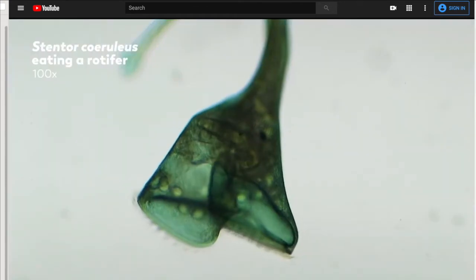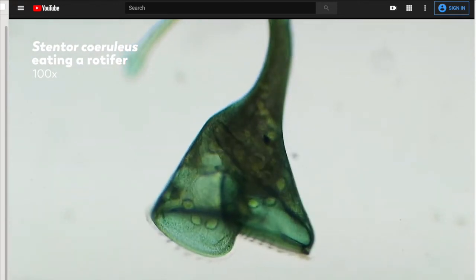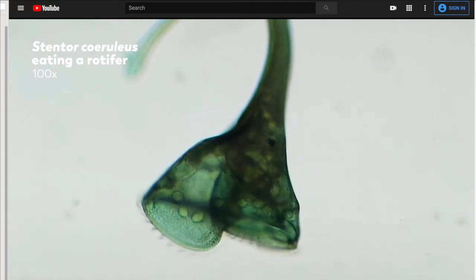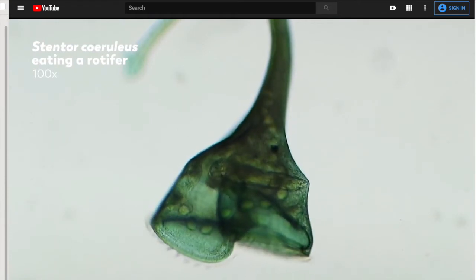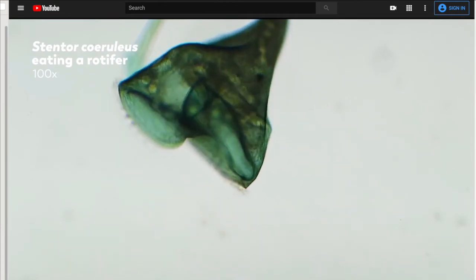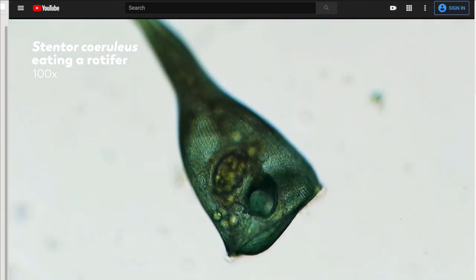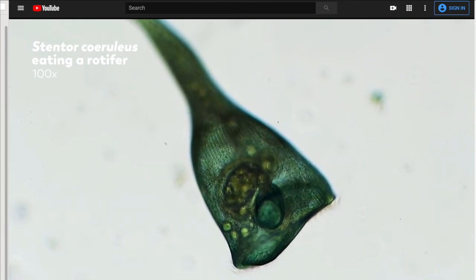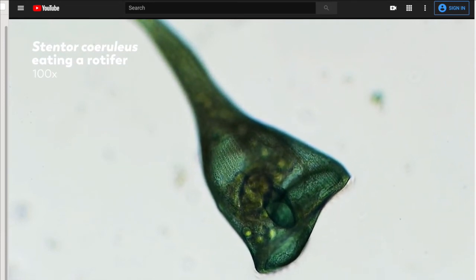digested. Just like this multicellular rotifer, which is swallowed by the giant Stentor caeruleus and waiting to be digested. We recorded this struggle for a long time and even witnessed the rotifer rupturing the stentor's cell membrane multiple times. Each time, the stentor repaired itself and the rotifer never managed to escape. After 25 minutes, the rotifer ceased its struggle. Just a reminder, rotifers have a simple brain and a simple nervous system. They can feel, I'm not sure about pain, but they can certainly feel stimuli.